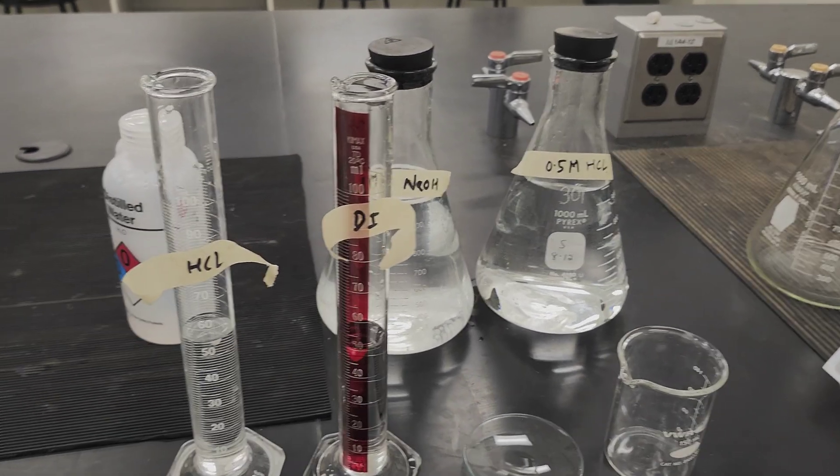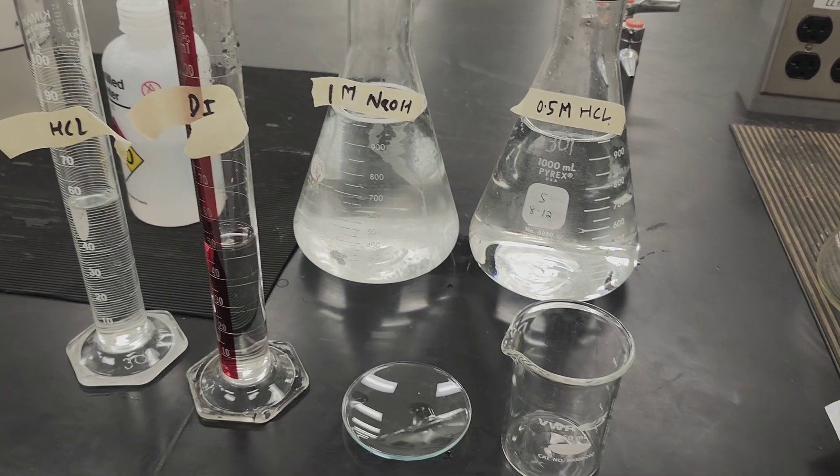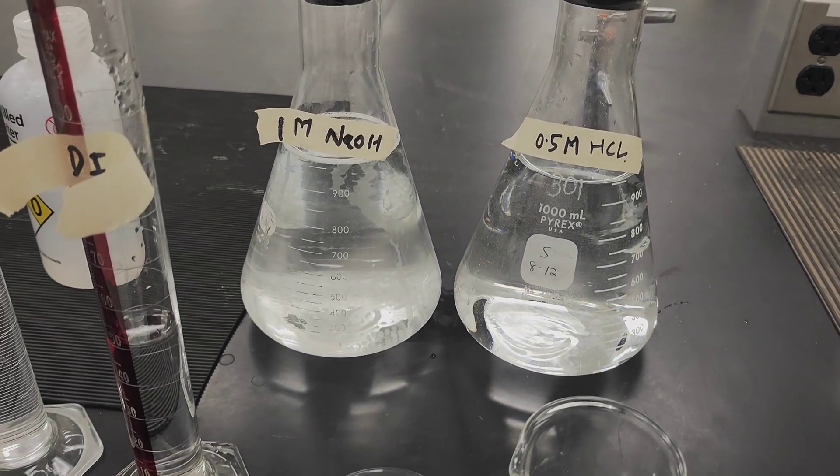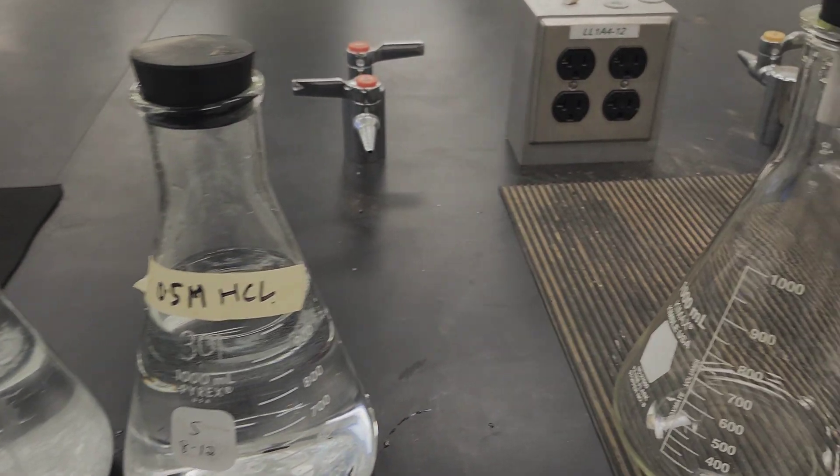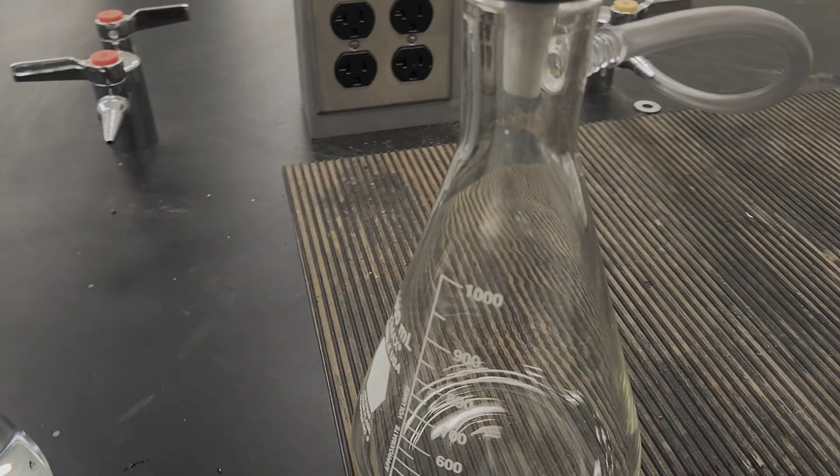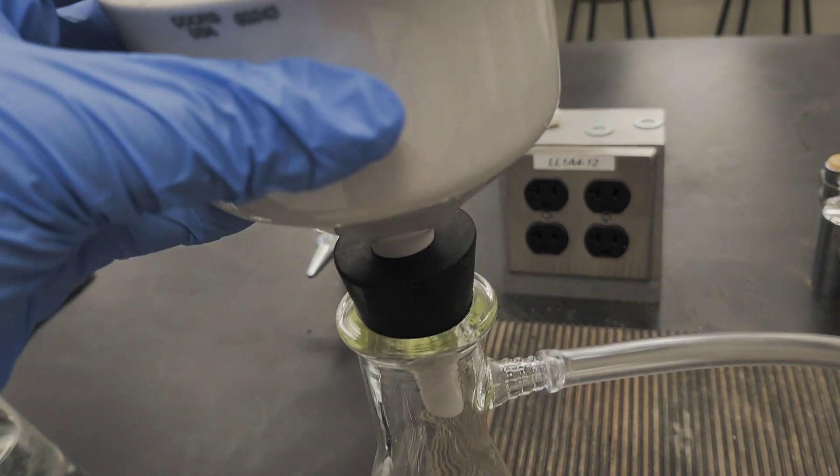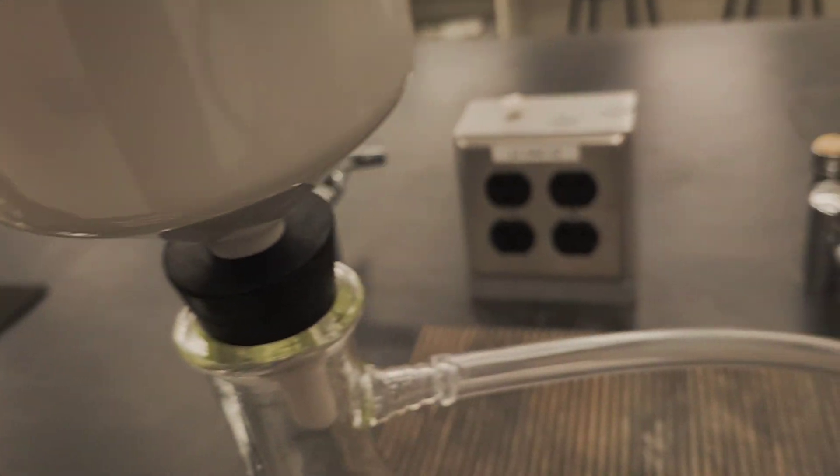This lab is for soil carbonate analysis. We need 10 grams of air dried soil, 0.5 molar hydrochloric acid, 1 molar sodium hydroxide, and other equipment like beakers and cylinders as shown in the video. This is a Buchner funnel which is connected to a vacuum for fast filtration.